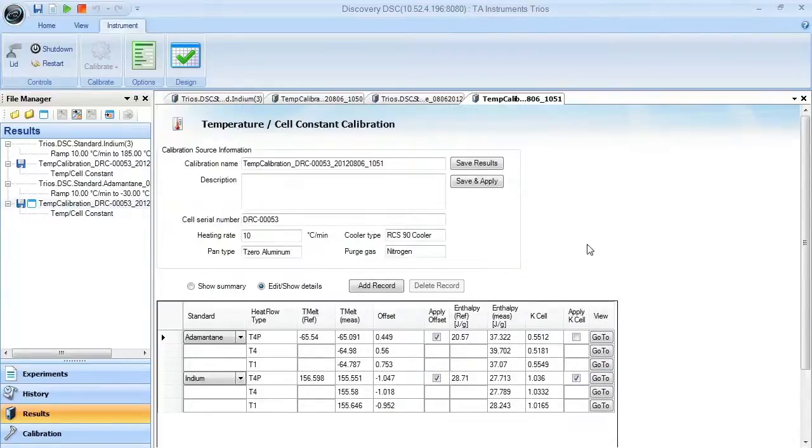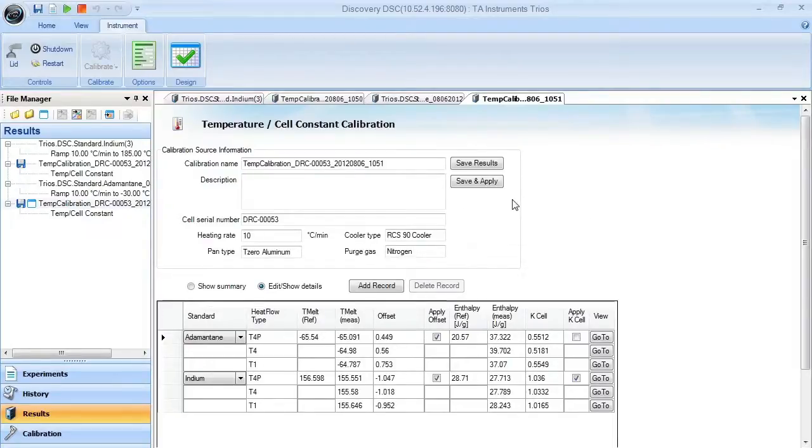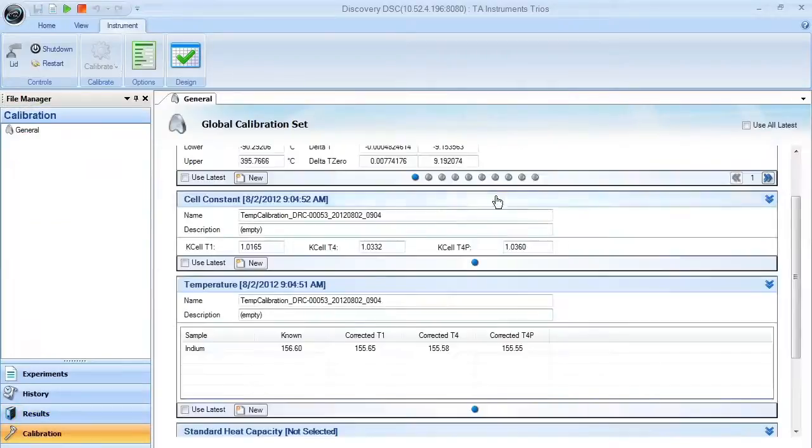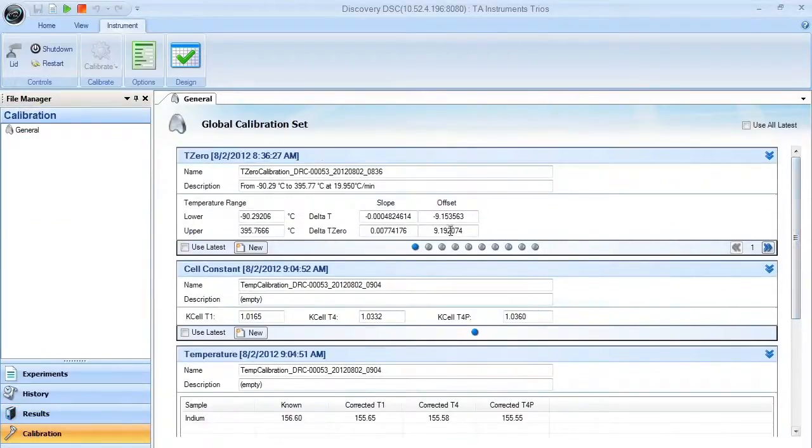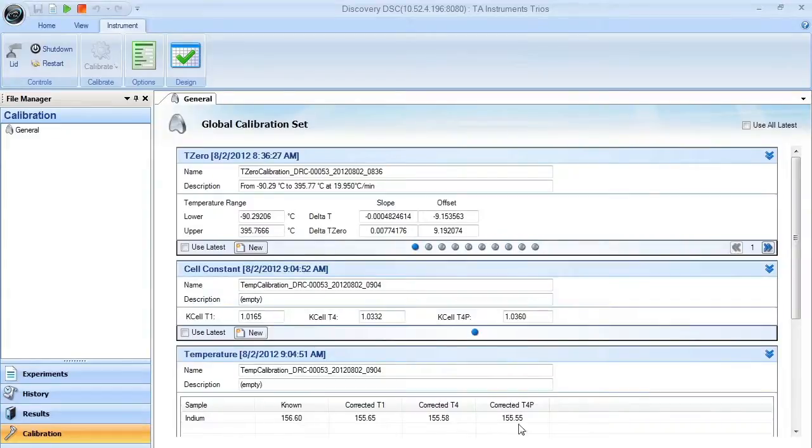When you're ready to apply this to your instrument, you just say save and apply, and the information will be transferred into your temperature calibration, cell constant, and temperature table. Once you have that set, you're ready to run experiments.